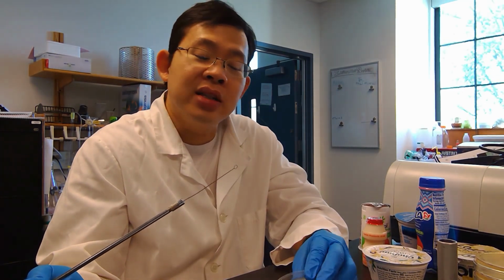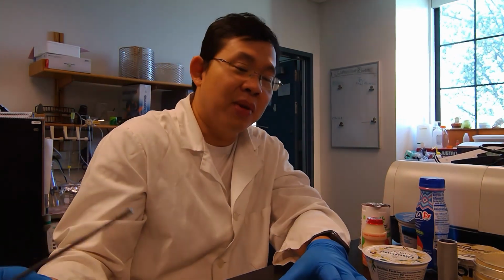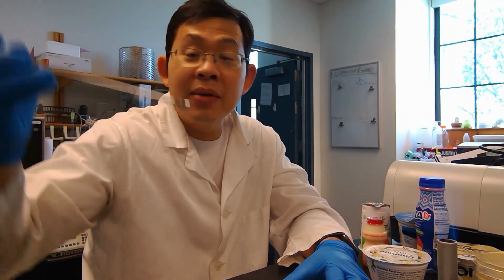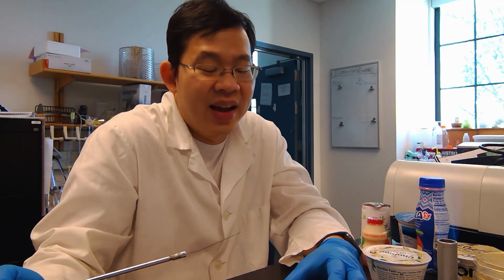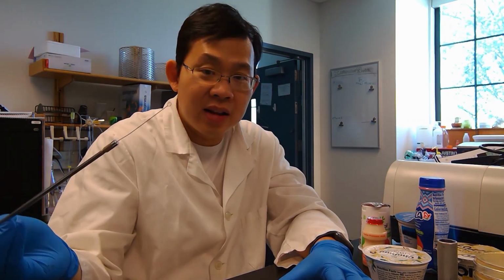One of the common mistakes that I found over the years is that people sterilize the loop and then, using the hot loop, they streak right away. That's not going to work. Your bacteria will die and you end up with nothing growing on your agar. So don't do that. Instead, you may want to wait a little bit.